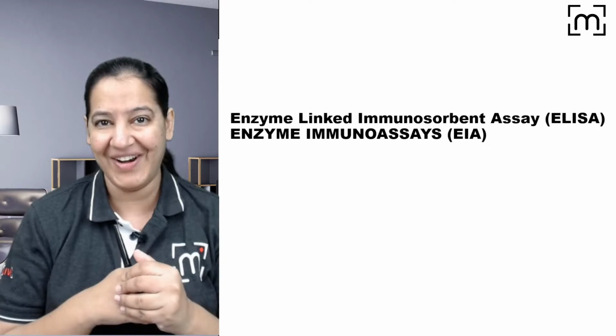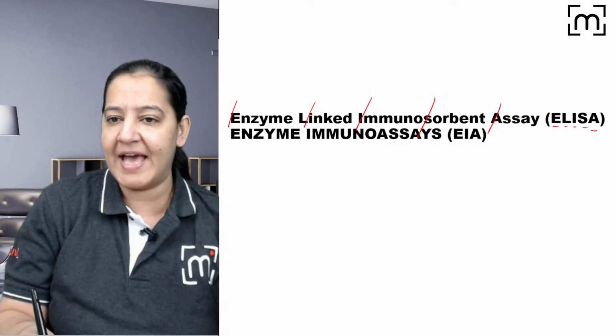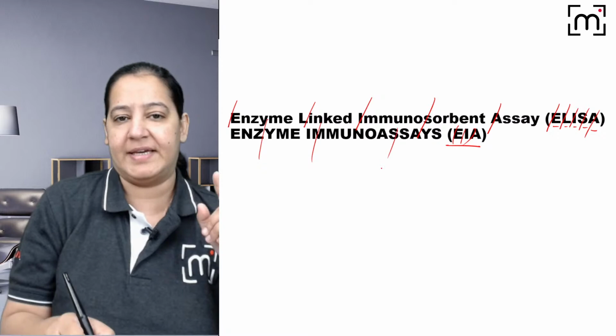The full form of ELISA is enzyme linked immunosorbent assay. That is known as ELISA. ELISA is also known as EIA, that is enzyme immunoassay, right? So one and the same thing.